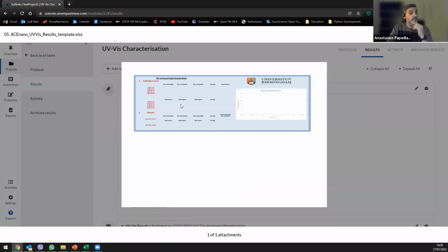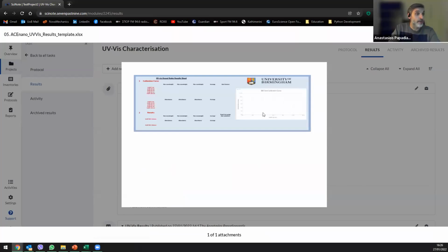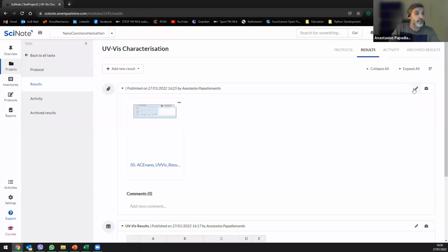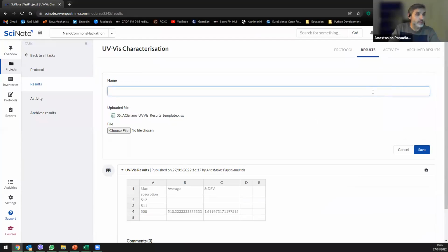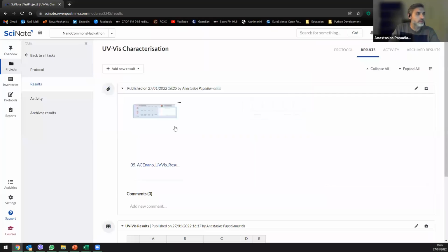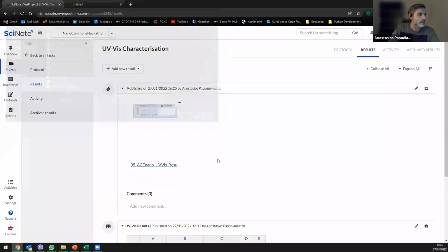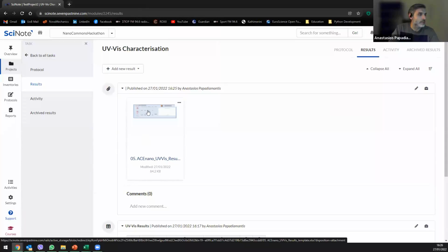And what we did here in ACE Nano, with one of our postdocs at the time, Emily, was create a file which you can use. Sorry about that.